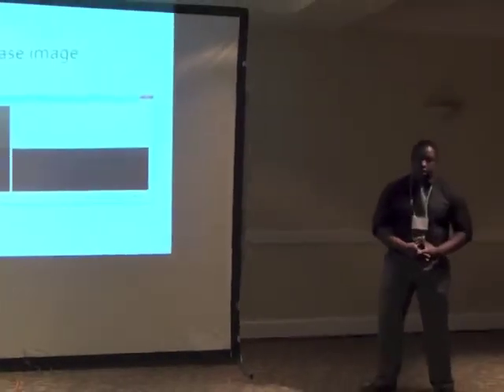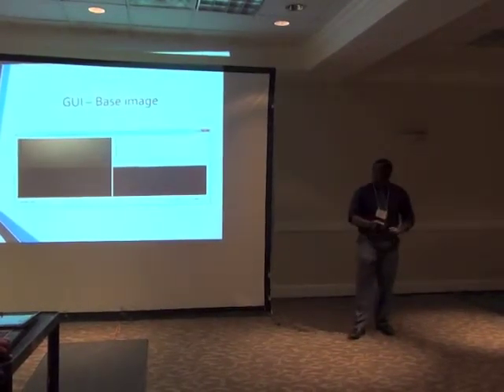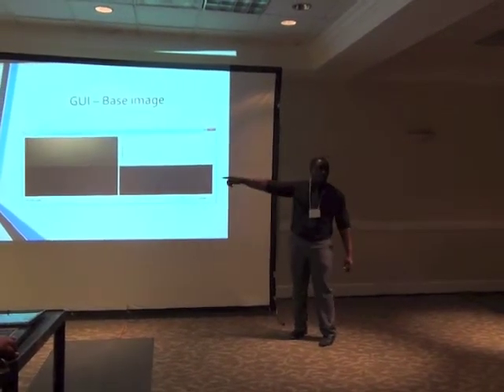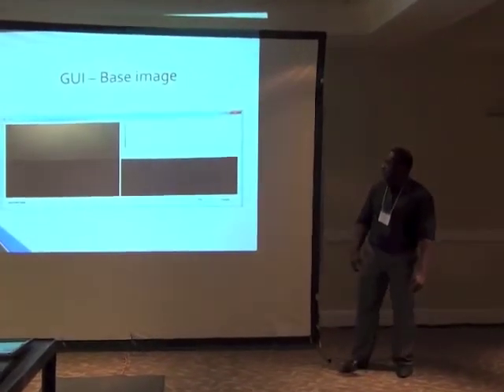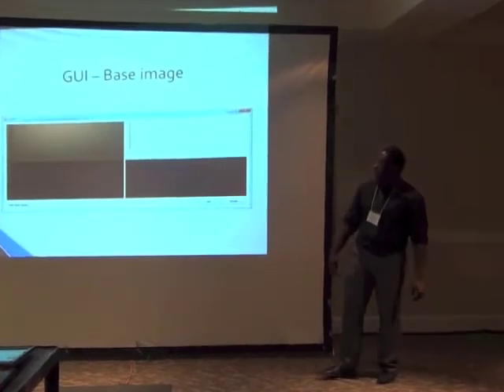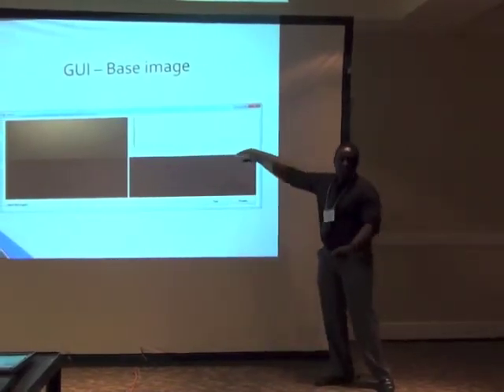As you can see here, we have our initial base image loader. How this base image loader works is that Dr. Ock usually takes an image of the clear field without the droplet. So after he's taken an image of the clear field, we ask them to input this base image. What our program does is that we run through and process and discern where the bottom of the needle is and where the base is.